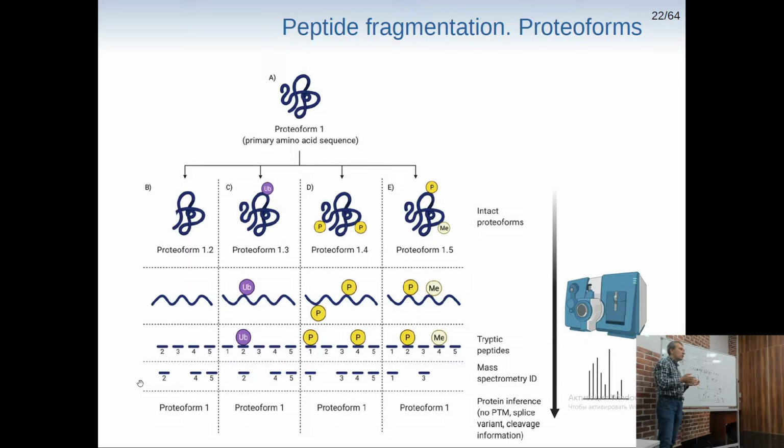So there is also a problem, and that's why we have 2 different approaches to see our proteome, the so-called top-down and bottom-up approaches. For now, just the names. We'll discuss a little bit later what each of them means, but one of them will be able to get you the largest possible number of proteins, but proteoforms are mostly omitted. The other one will not have so much coverage, just the coverage of a 2D gel, no more, and you will be able to get all the proteoforms which are there. And you have to decide which one of them to use, because there is no universal instrument in proteomics, unfortunately.